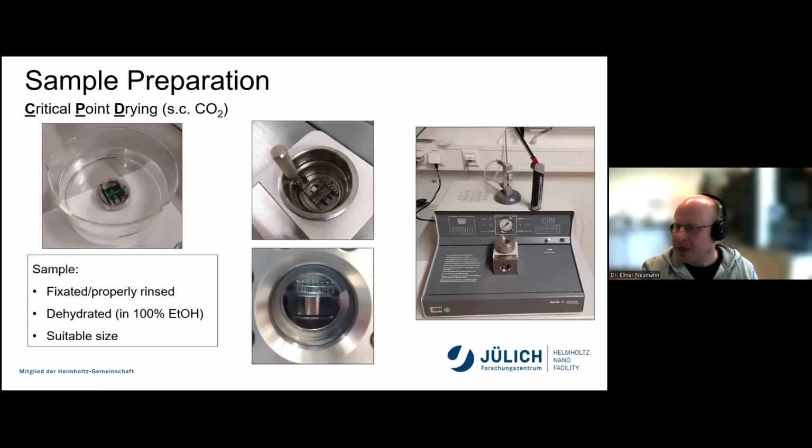Next thing. If you're not interested so much in the inside of your sample, but mainly in some other structural points of your cell culture on top of this, you go through the critical point drying process in this case.